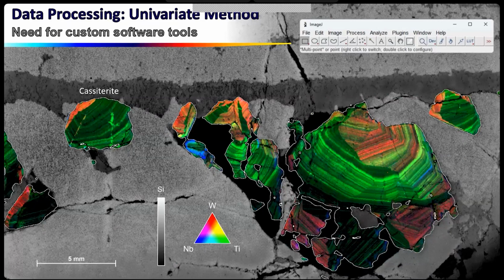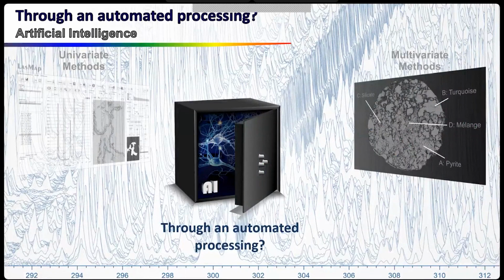And there is an important competence to get: when you discuss with someone that brings you a sample, you have to really understand what the user wants. Because I could send to the user these 10 millions of spectra and say, manage it by yourself. Or no, I can make a synthesis of the results and give him only what he would like to see. So there is the univariate method, the multivariate methods, but both of them really need strong expertise.